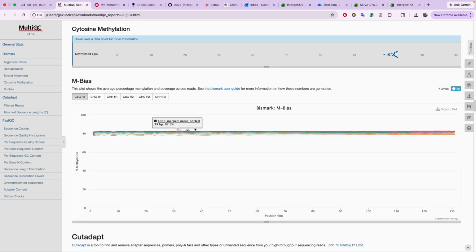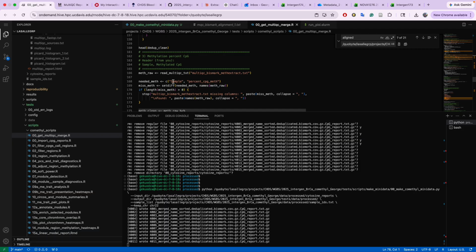which is to do with the methylation bias when you're moving from the different positions within your read. It should be uniform. I don't know if you had been there when I presented it in, I think, a lab meeting for Victoria samples. We're using a different method, and then it was like not uniform, basically. And there were some concerns because that would affect the methylation signal you're getting. So the methylation bias should be uniform when you're looking from the first position to the last position. So that's that about the MultiQC.